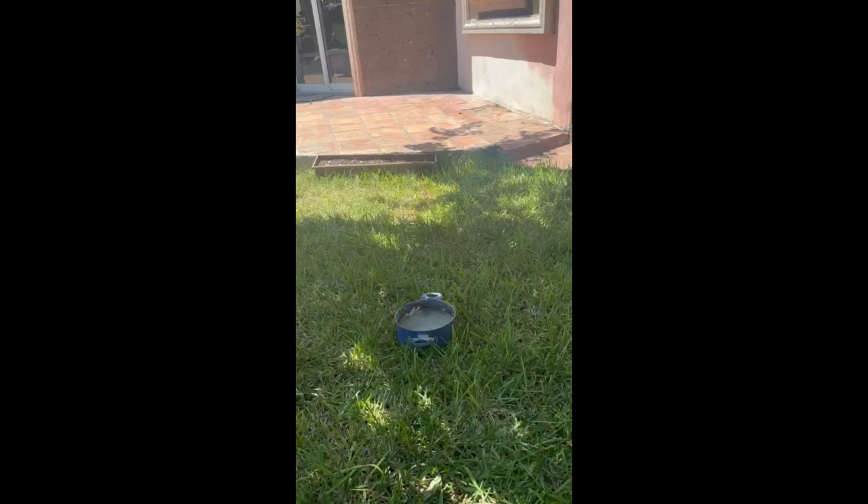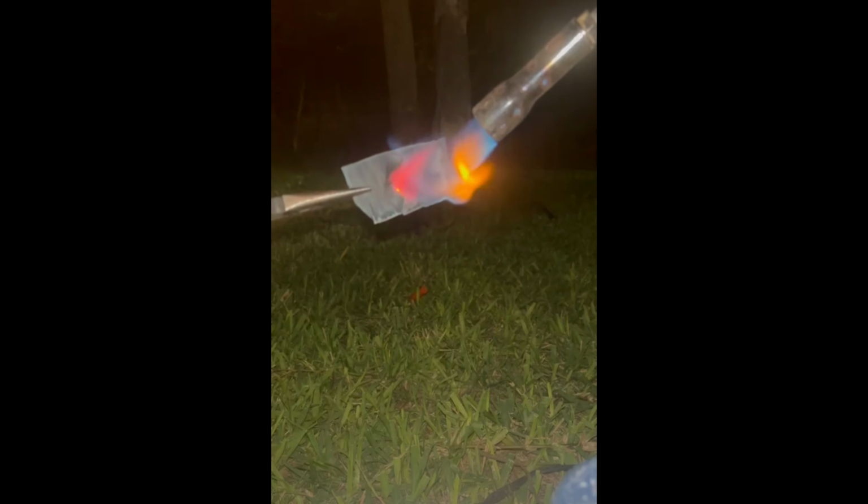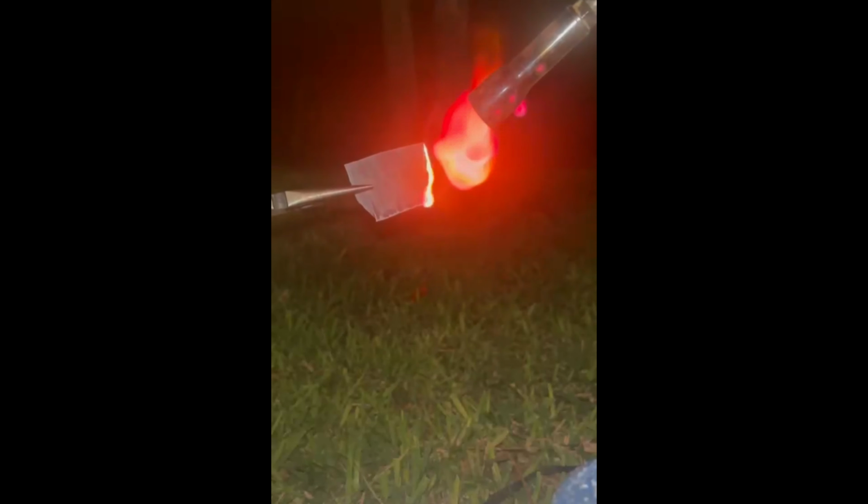The other test I did was burning it with a blowtorch. At first, a carmine red appeared as said in the intro of this video, but then it continued to burn, making a pretty bright light that could be compared to the one made by magnesium metal.